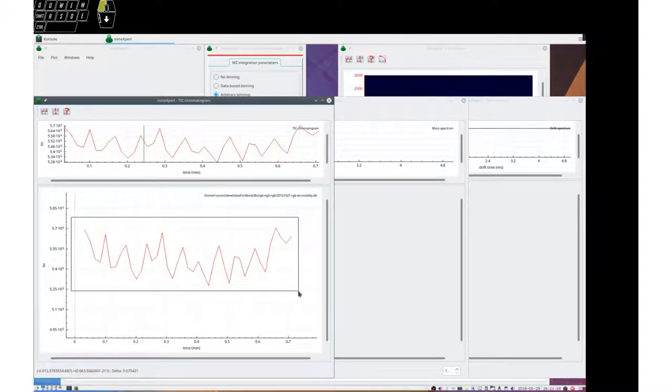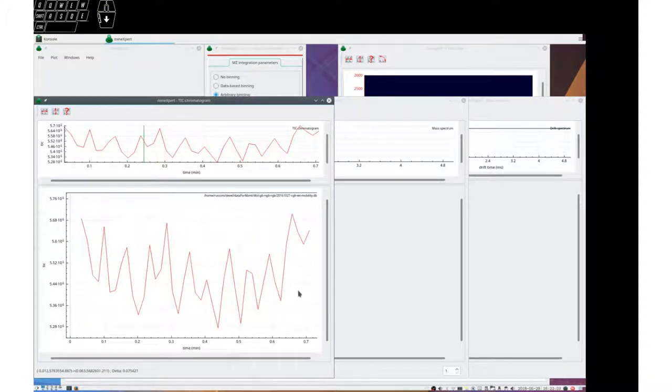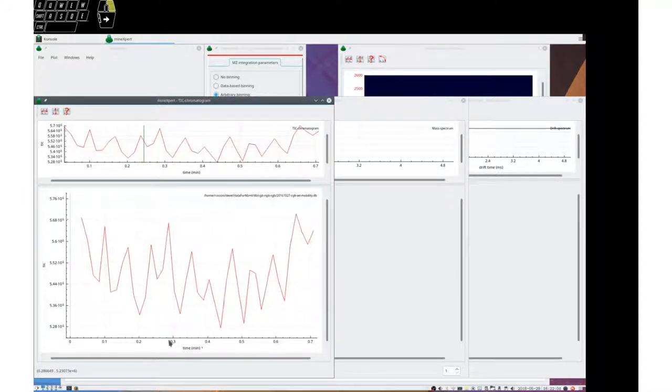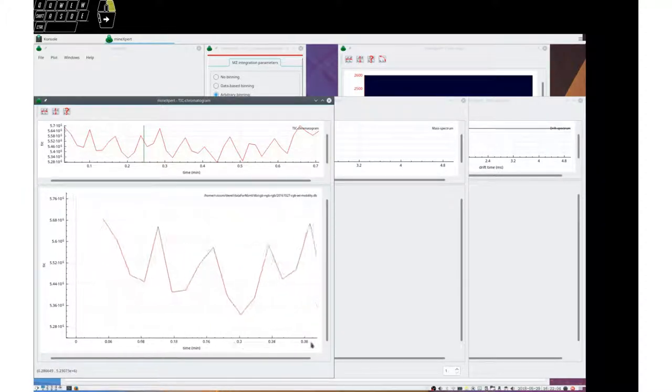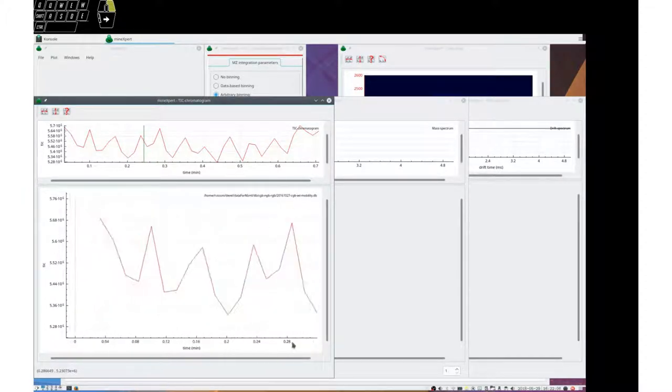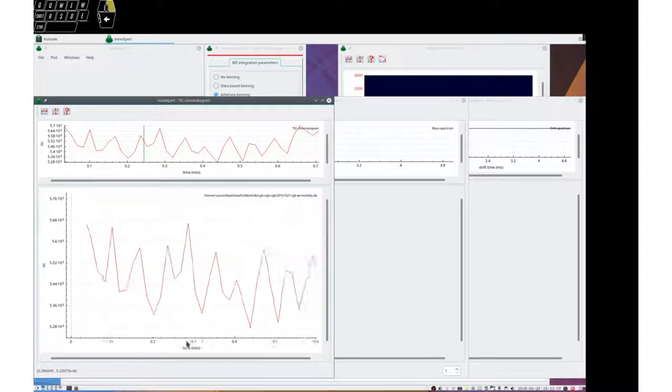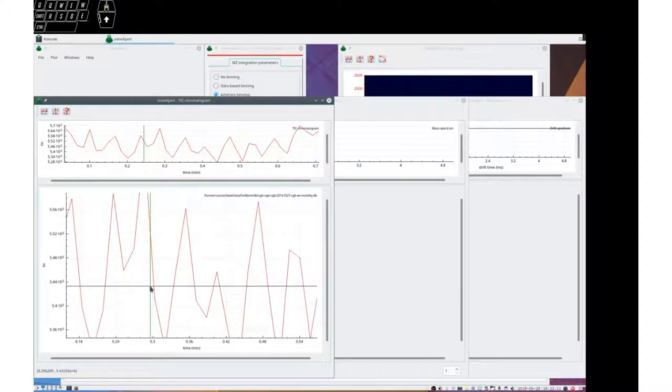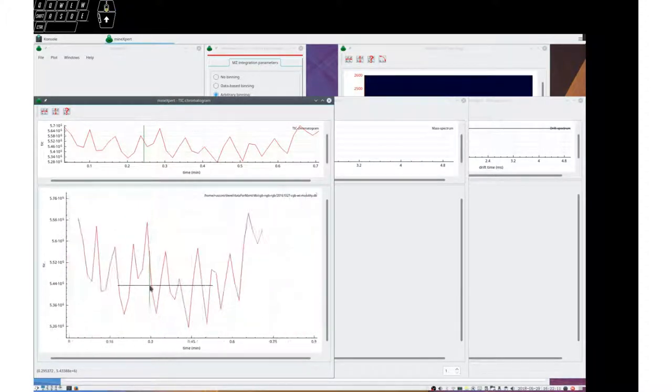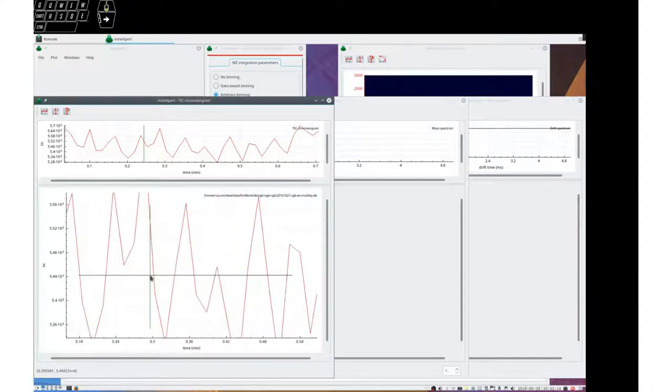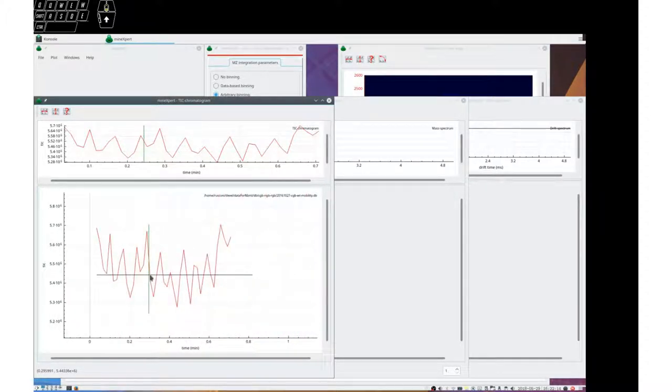So, let's look. Selection, that's a zoom. Right click, that's another zoom.